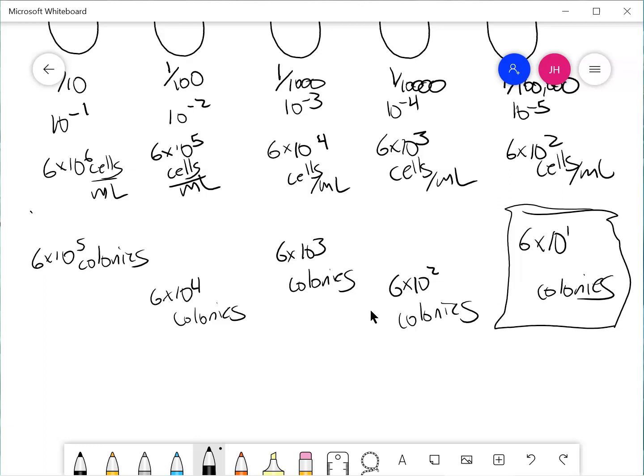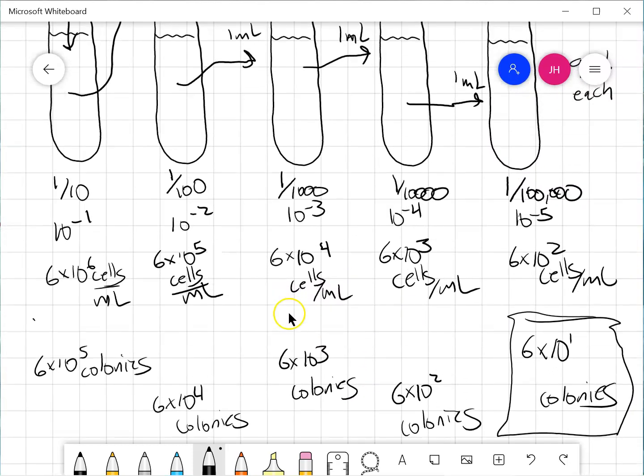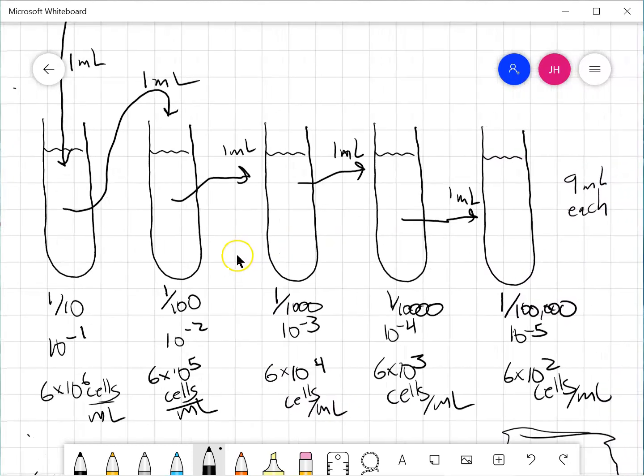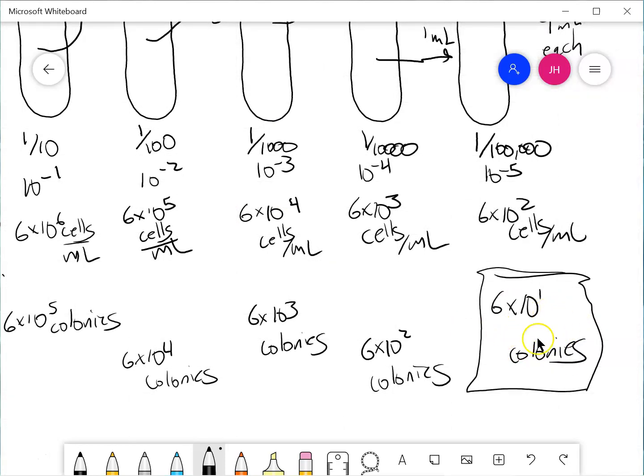The water in that sample will be fully absorbed, and so that's a standard amount that we'd put on a petri dish. So by doing this serial dilution, we achieve a concentration within a range we can count.